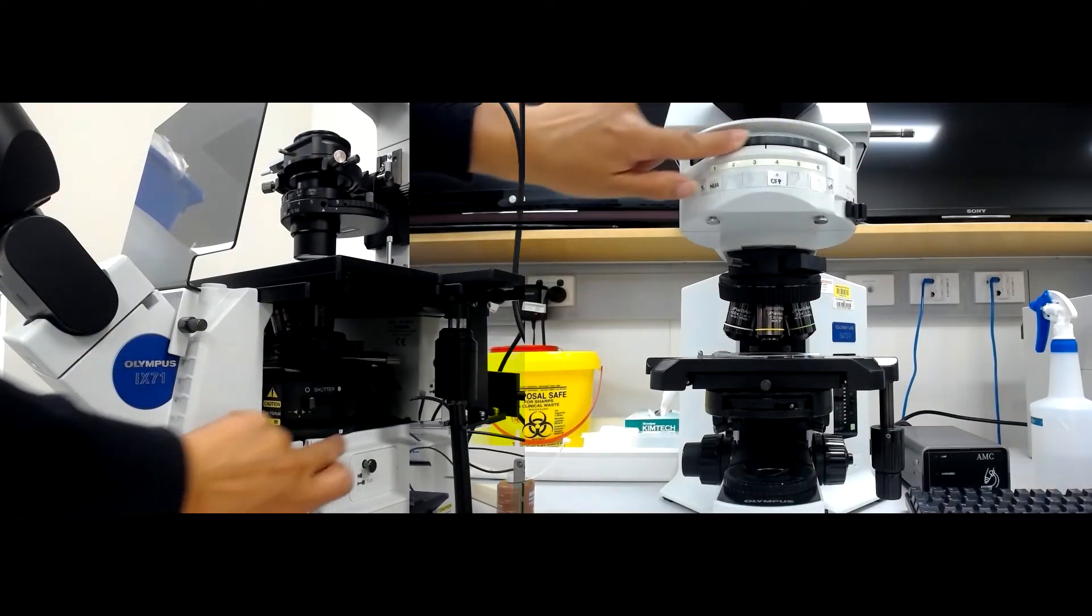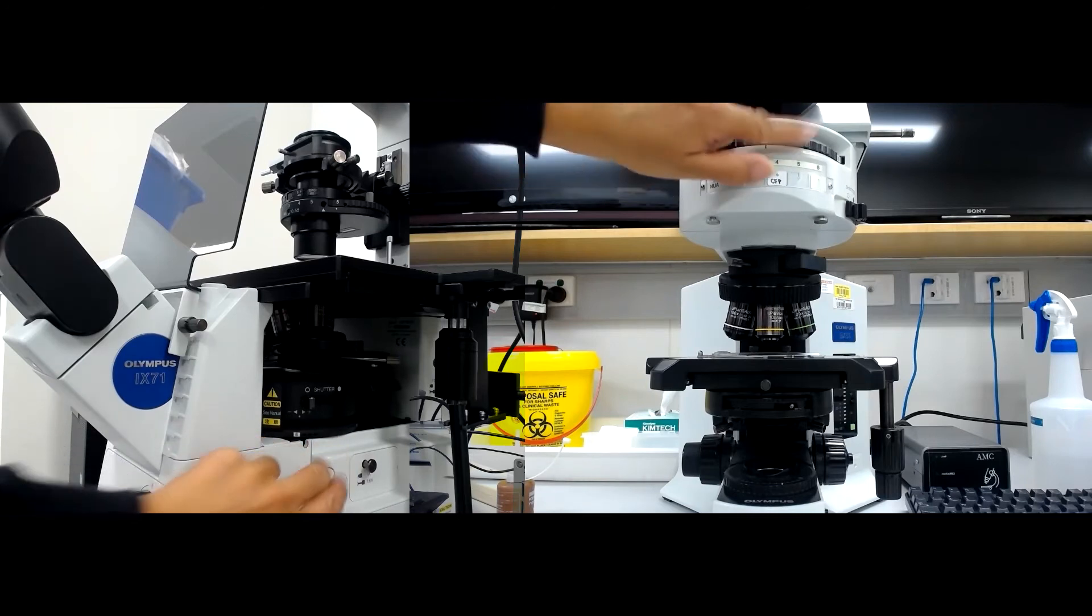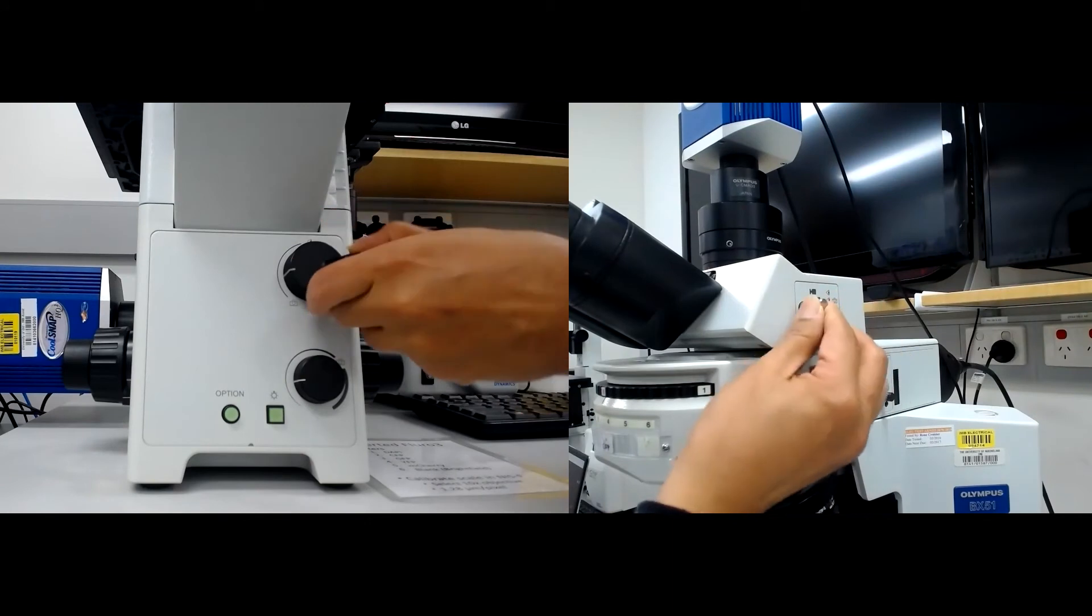Turn the emission turret so that the correct filter is in place for your fluorescent signal of interest. Make sure the light is directed to the eyepieces.